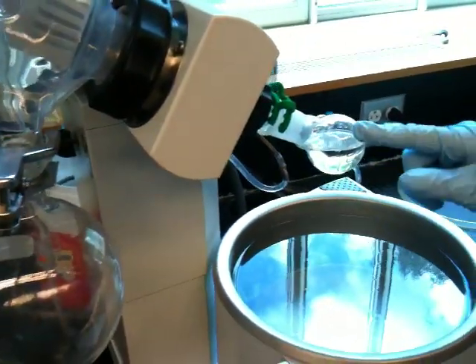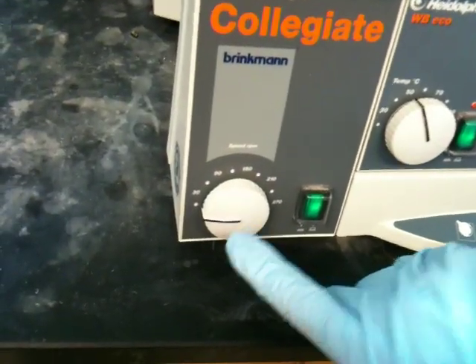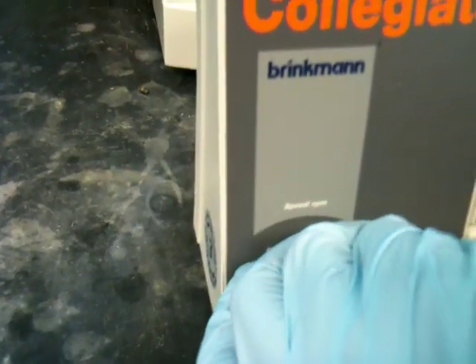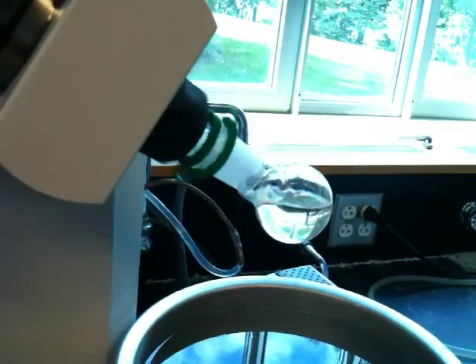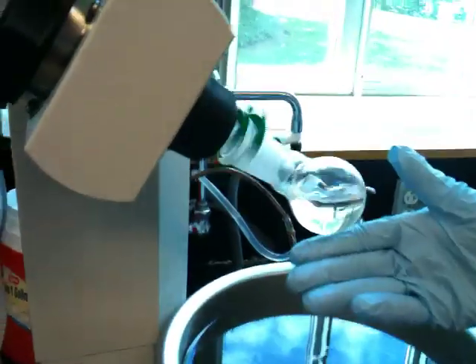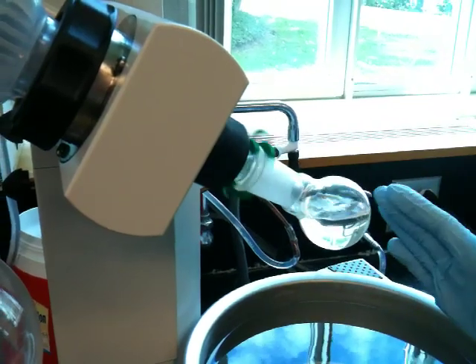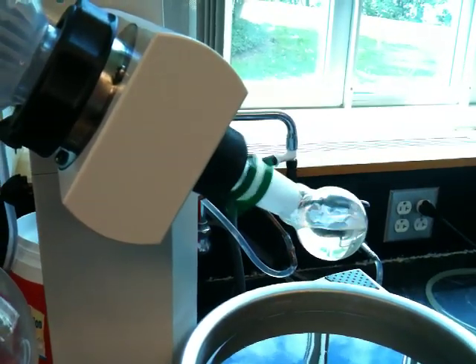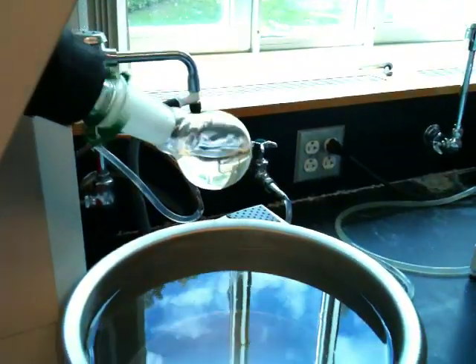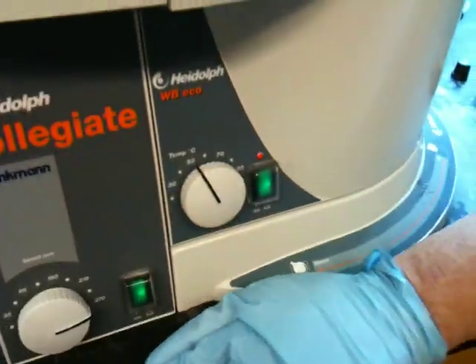The next thing you want to do is start the flask rotating. The rotation involves taking the rotation knob — it says speed RPM — and turning it up until the flask rotates, as I always say, really fast. I have no particular setting; I just try to get it as fast as I can. The rotation causes the sample to spread out over the glass, and the spread over the glass will increase the surface area for evaporation, so the evaporation is much more rapid. The next thing you want to do is lower the sample into the water — this entails pushing down on this lever and lowering the apparatus into the water, and it really only needs to just touch the water.